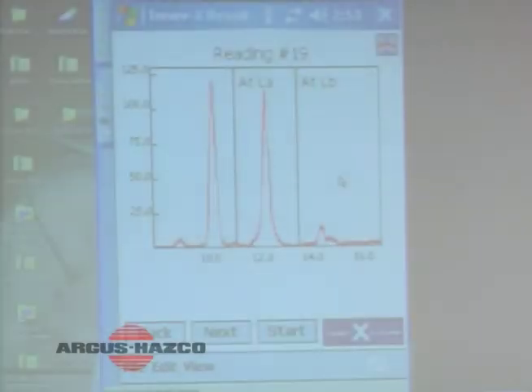They're stronger X-rays. The beta peak comes through more layers of paint than the alpha does. So that's why if the alpha peak is higher, it's not coming through much, if any. And as they start changing, there's more and more non-lead over top of the lead paint. Okay? That's why the spectrum comes in handy, one good reason.